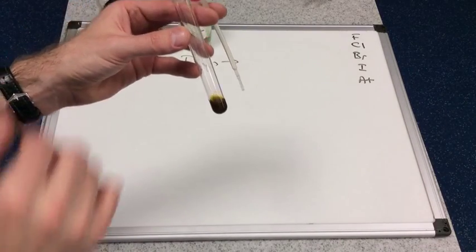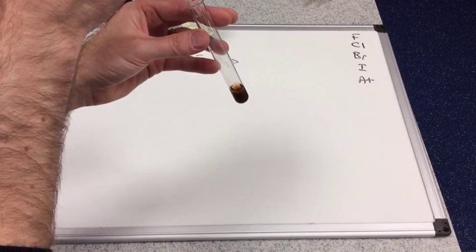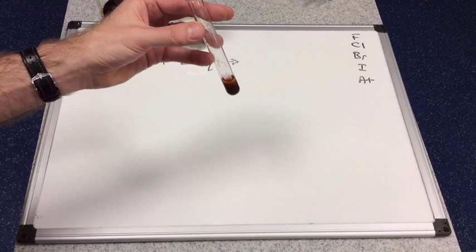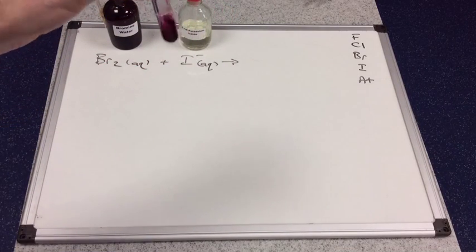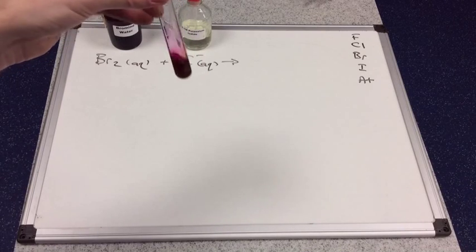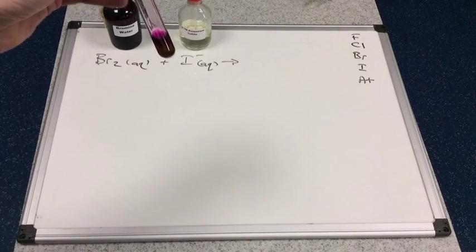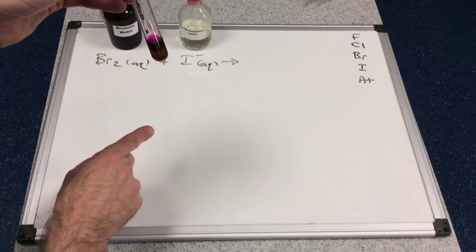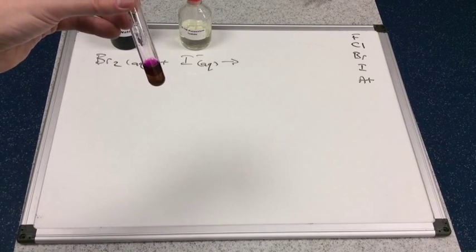We'll put some cyclohexane in to see if we can see the displaced halogen more clearly. I'll just give that a shake. And I think you can see the purple color appearing. So that's confirmation that we've definitely got iodine inside that test tube. We didn't have iodine at the start, we had iodide, and so the iodine has been displaced.